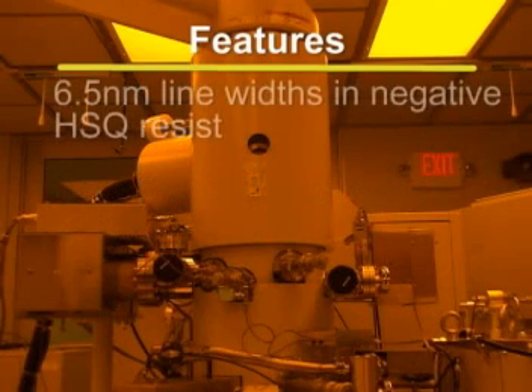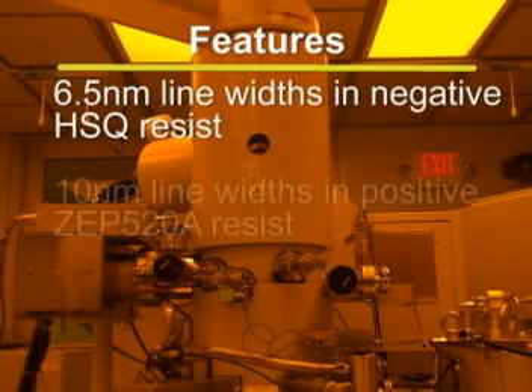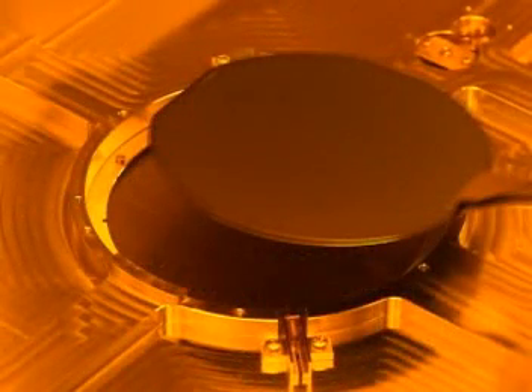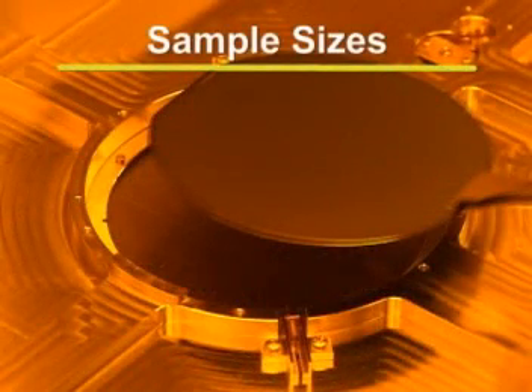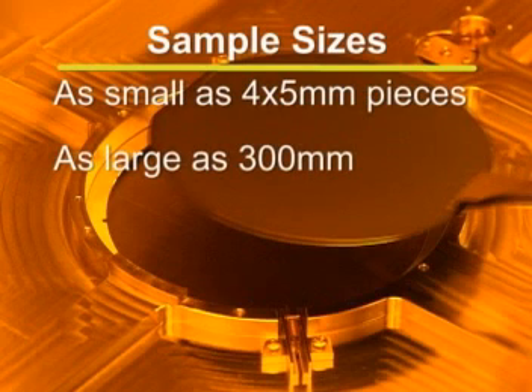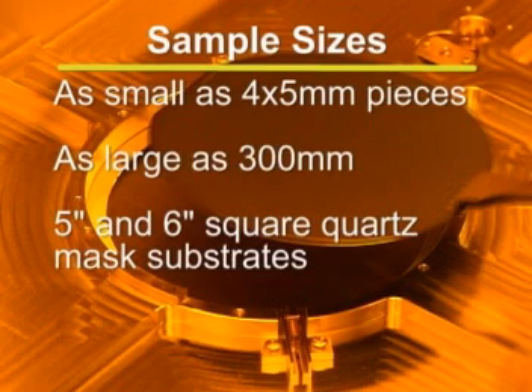The tool has demonstrated 6.5 nanometer line widths patterned in negative HSQ resist and 10 nanometer line widths in positive ZEP520A resist. The JBX9300 is capable of processing many different sample sizes. Samples can be as small as 4 by 5 millimeter pieces and as large as 300 millimeters. In addition, 5 inch and 6 inch square quartz mask substrates can be loaded.